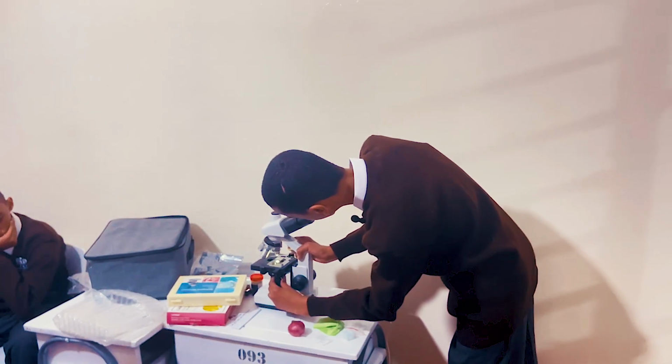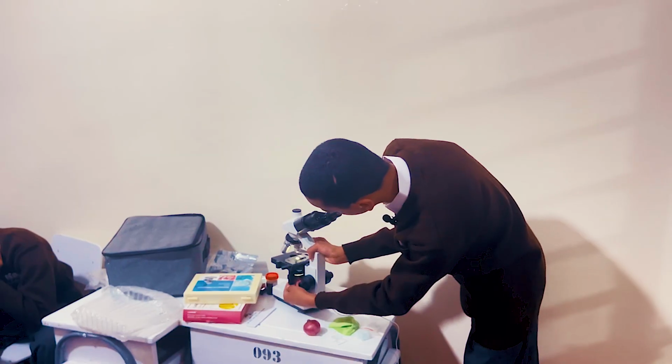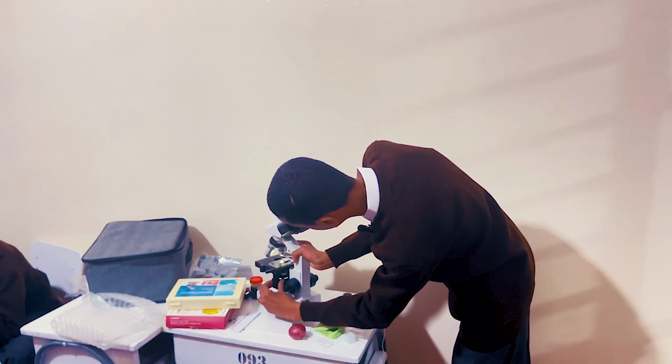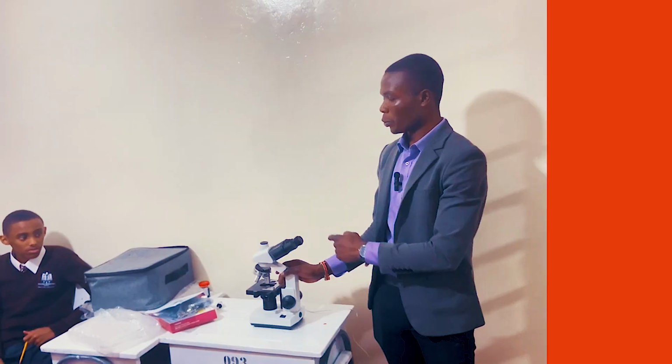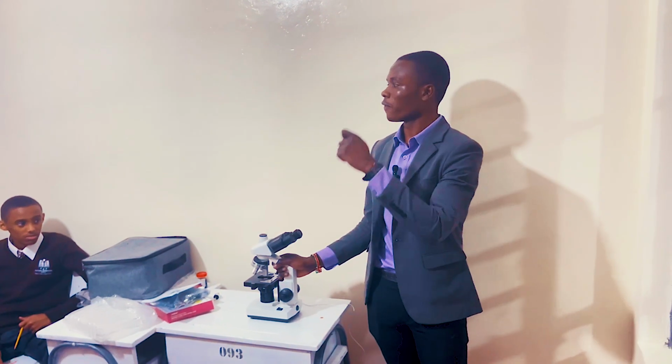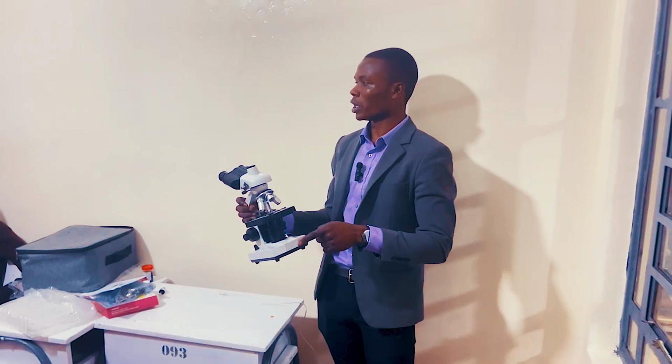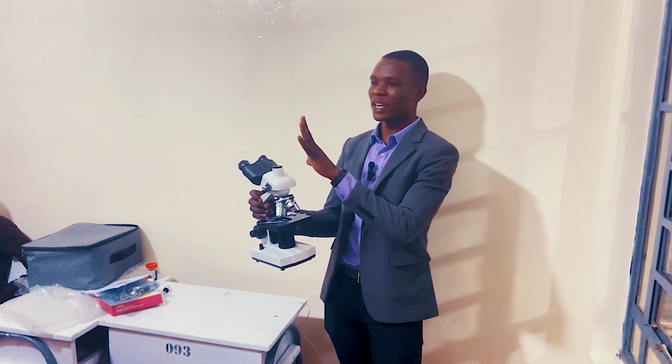If you want to slide the stage, you use this knob under the stage. This one moves it left and right. This one moves it up and down. Again, we also talked about the parts of the microscope. Unless you know the parts, you cannot be able to use it, right? So if you look at this microscope, it's the same one that's drawn in your books, okay? So we have very many parts here.